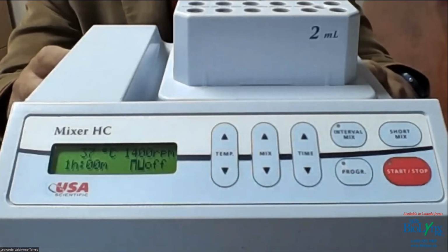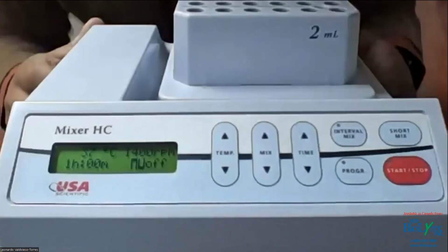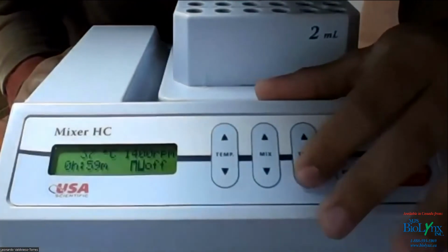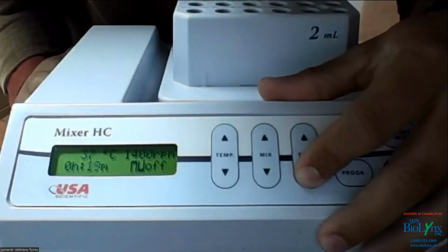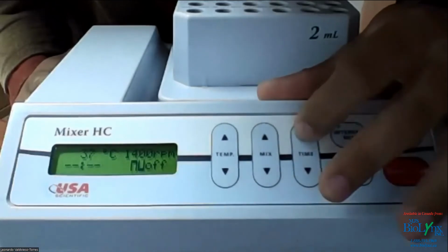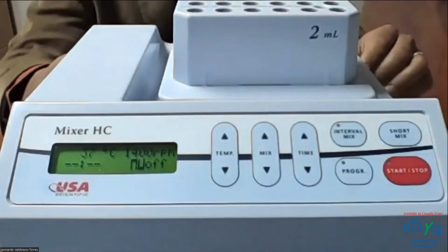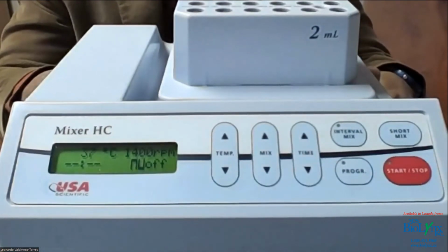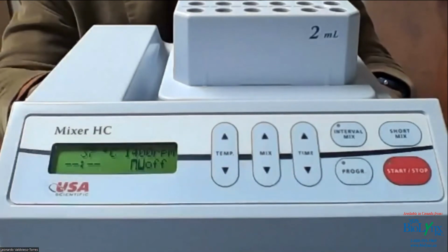Leonardo, it's Sharon. I have a question. You just said you can put it on for infinity, which means it just keeps going continuously. You don't have to set a time. Is that correct? I was talking about the heating block at that time. I think that's a good question. Leonardo, this is Tanya from BioLinks. I looked it up in the specifications, and it can be programmed up to 99 hours. So I think that's more than sufficient for overnight. Yes. Thank you, Tanya.